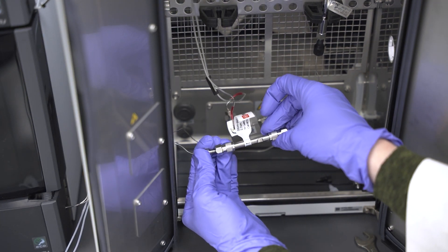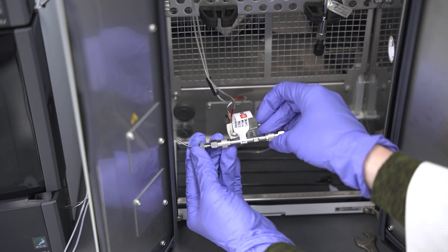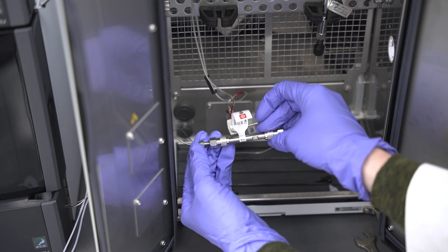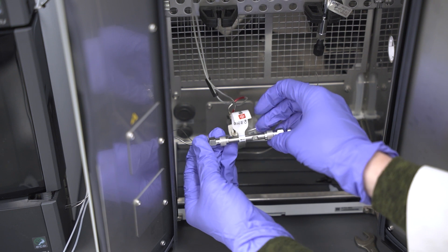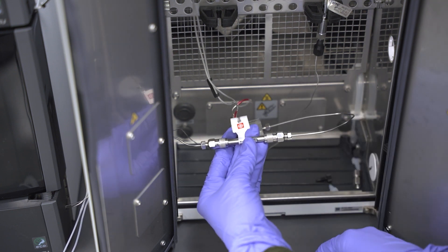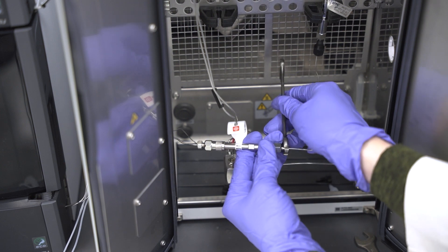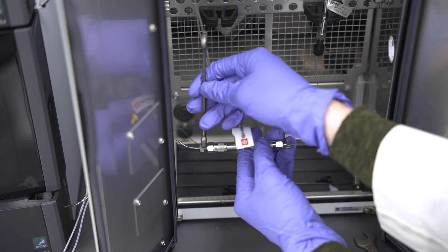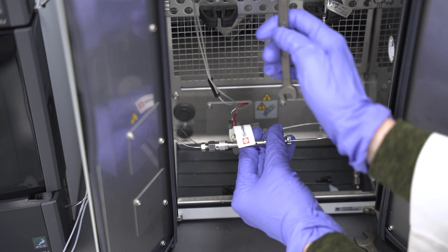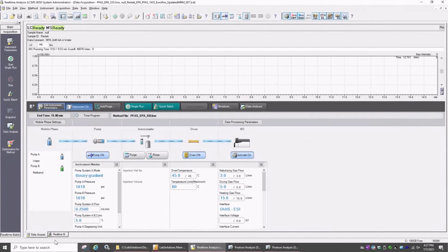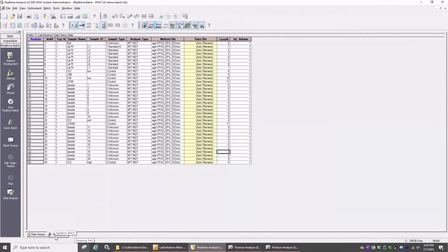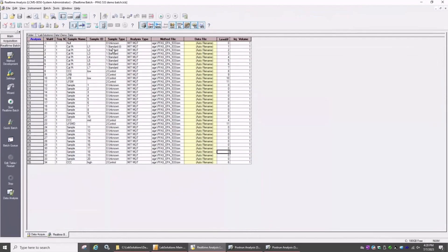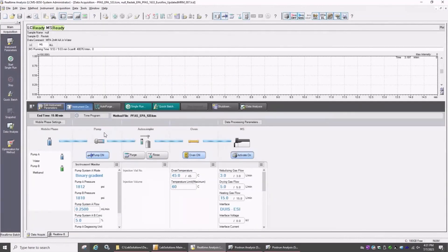Connect the delay column with the correct orientation. Once the system is set up, it is easy to perform PFAS analysis according to the method package. All that is left is to update the retention times of the analytes of interest.